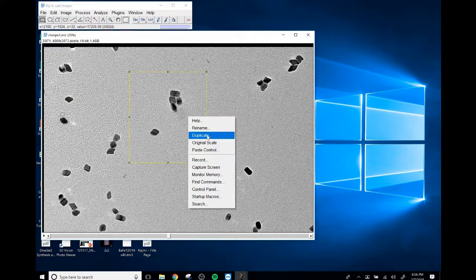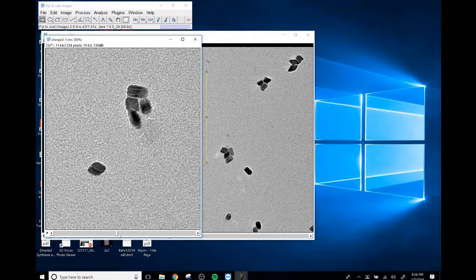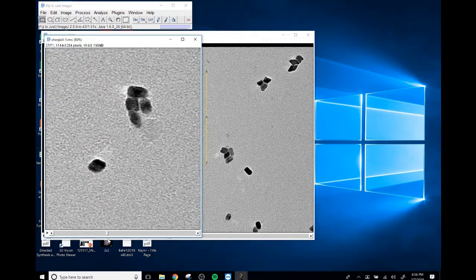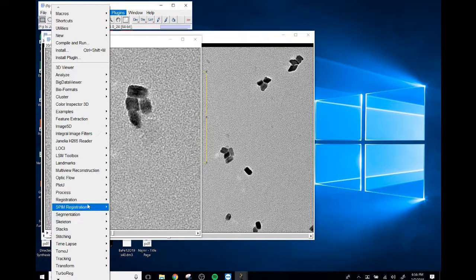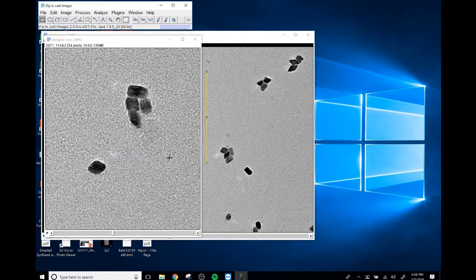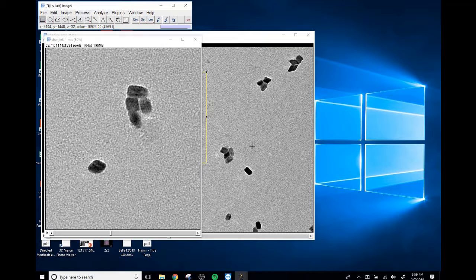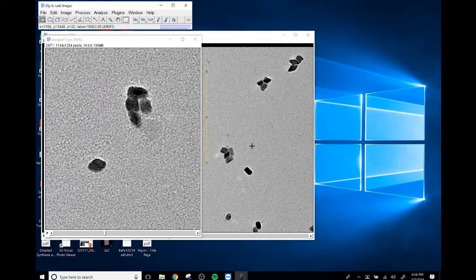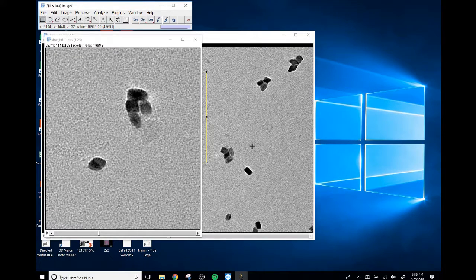And let's duplicate this stack. Duplicate the whole thing, and now we just have these particles, maybe a few more pop in later on. Okay, so let's see what happens if we try to do the stack registration for this. Registration, translation, and we're going to go. I was kind of hoping this would be a little faster. Oh, there it goes, now it's picking up.